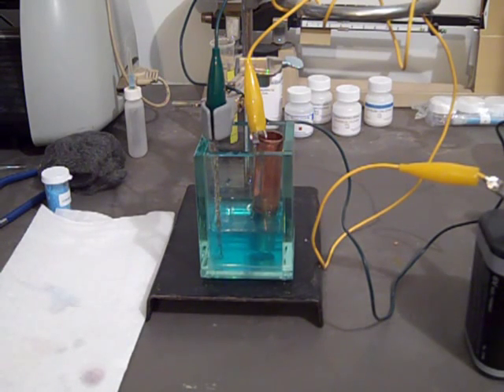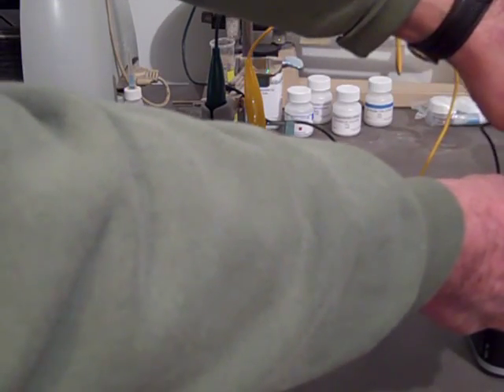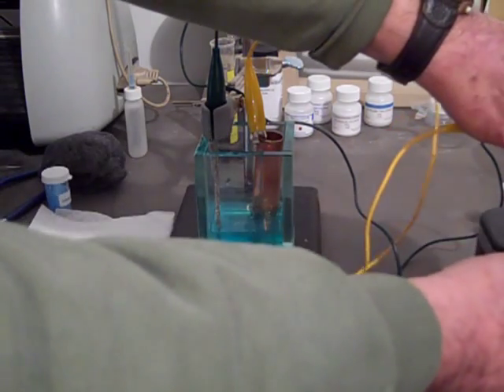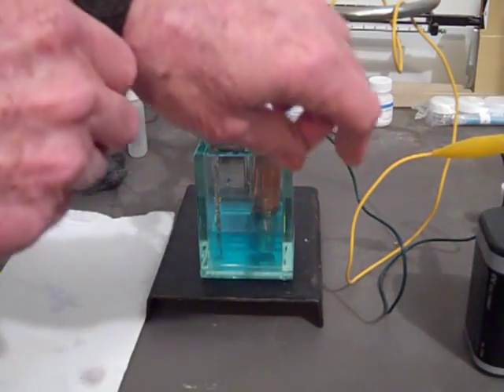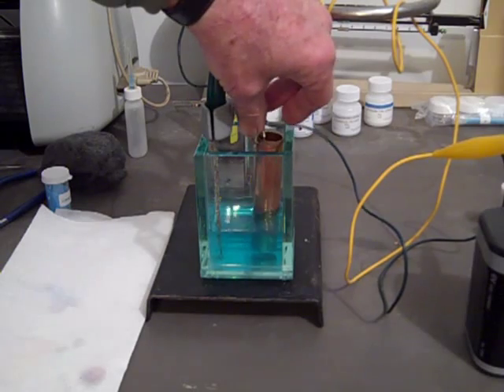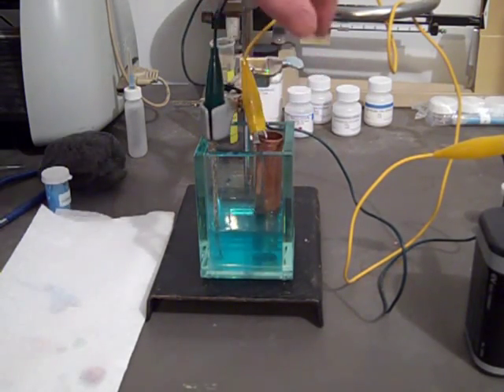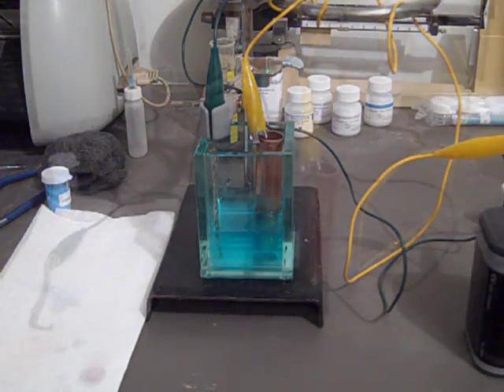Now we're going to reverse the current — put the negative terminal onto the copper and the positive onto the silver — and let it go five more minutes. We'll check the copper to see if anything happened from the last run. Nothing. Same clean copper end we had before.